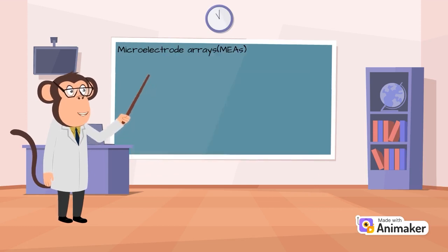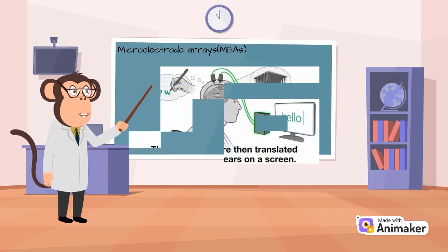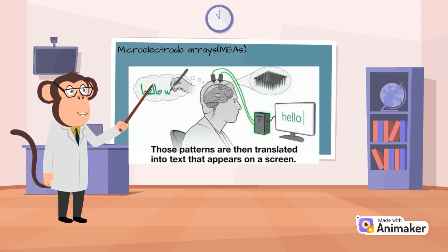A microelectrode array is a grid of tightly spaced microscopic electrodes embedded in the bottom of each well in a multi-well plate. Cells, such as cardiomyocytes or neurons, which are electrically active, can be cultured over the electrodes creating a cohesive network. The functional behavior or electrical activity of this network can be recorded.